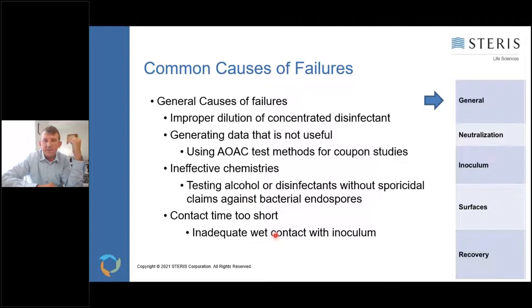Typically, labs will store alcohol or store spores in alcohol solutions for use in studies. So you're certainly not going to get the kill there. So if you do that testing and you're testing alcohol and say, well, I'm going to go ahead and include some Bacillus species in this test, you're really just wasting time and money because it's not going to work.